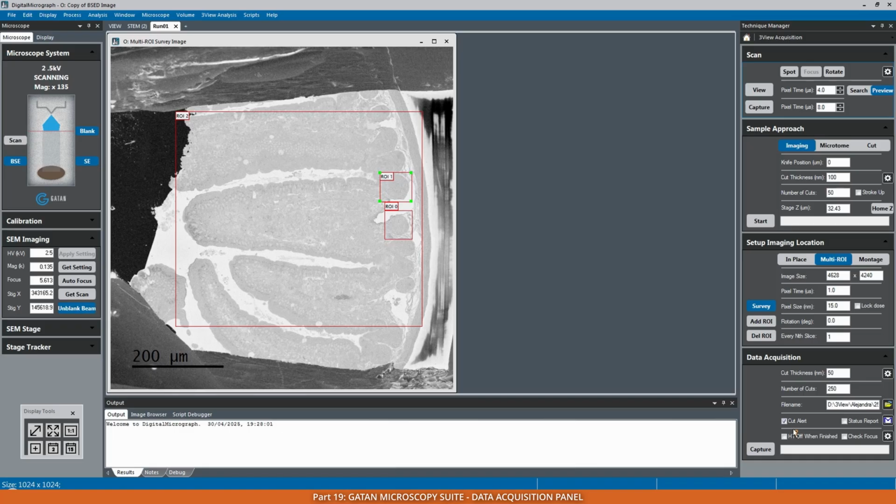The larger the value, the easier it makes it to work. Then in this settings button, you can specify the cutting speed. Well, actually, I can see here it's quite high speed. Typically we cut at 0.1, with oscillator, and the retraction speed is 1.2. The settings at the approach mode are different from the settings in the imaging mode. But the idea is to try to make it as slow as possible. 0.1 is a really good number.